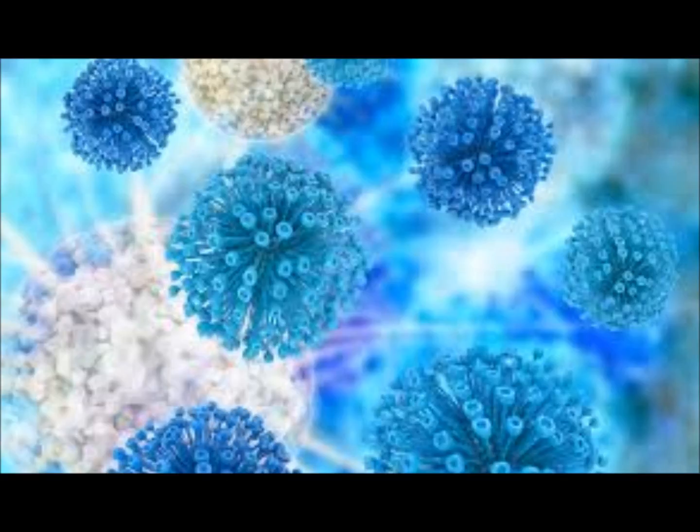So I kind of like her way of doing groups of 10, like there's 10, there's 10. Because you'll think, oh my gosh. Now if the whole plate is full with individual colonies, you know it's greater than 10 to the 5th if it's the same organism. The problem becomes when there's more than one. Okay, number 50, you already know the hemolysis. So partial lysis is the alpha, clearing is the beta, no hemolysis the gamma.